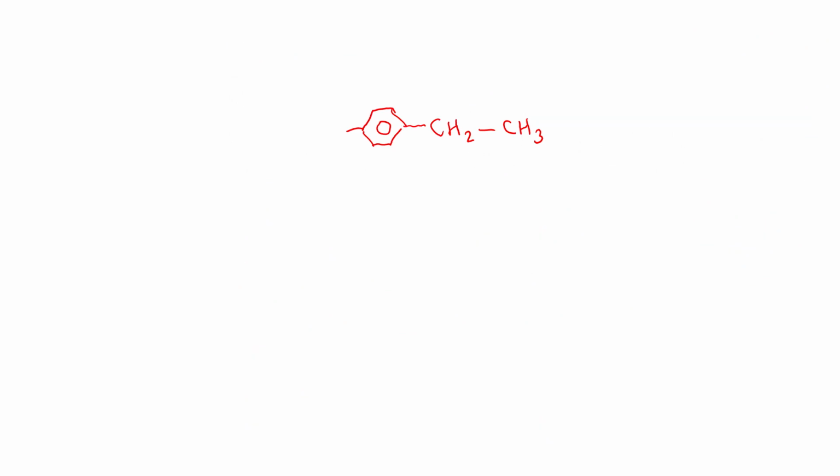Okay, so let's just put our two structures together. So this was the first bit we worked out, and we can now just add on our second bit that we've worked out, which is that we have CHOH attached to CH3, and that's our whole structure.